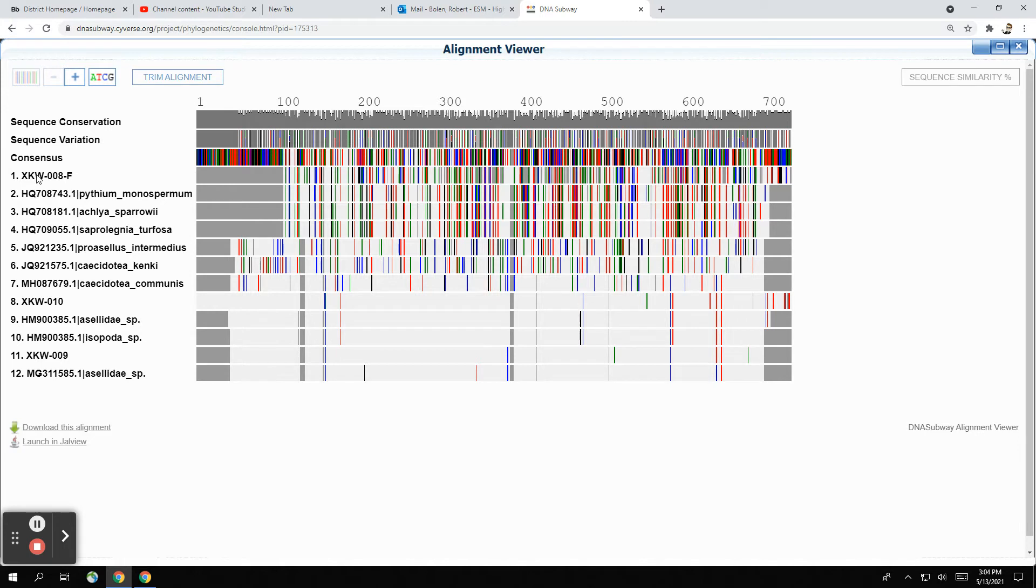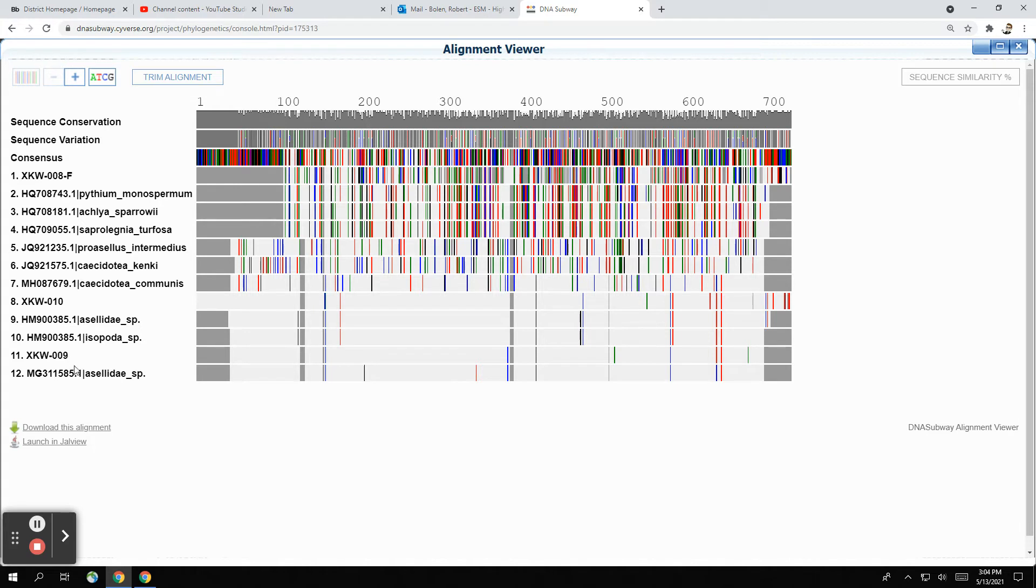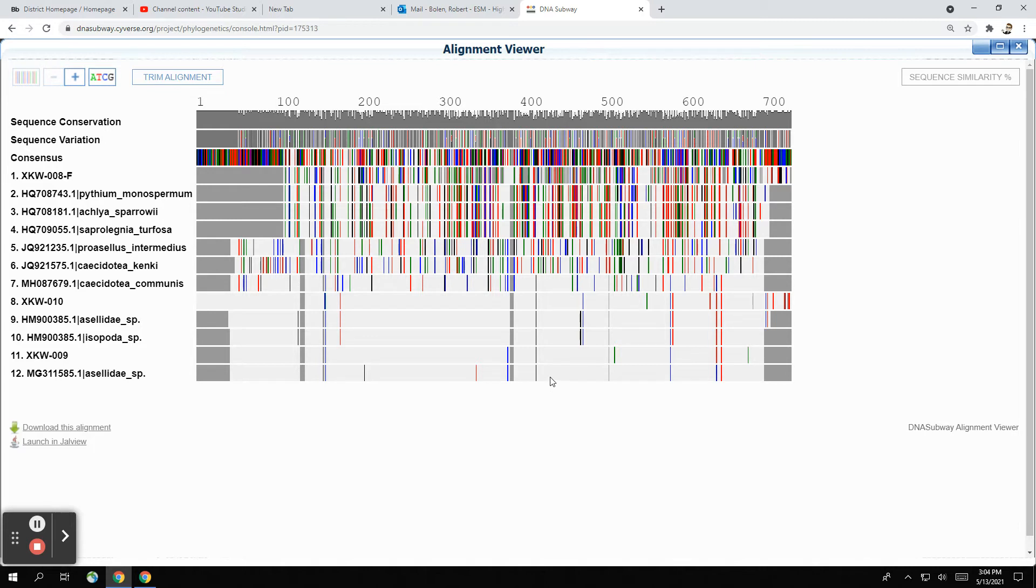And then this is our first sample and this is the top hit for it. Here's the second, third, fourth hit. Here's our other sample and the hits that it matches up with. And then this is the last one and what it matches with. And when you look at the barcodes, you can see that down here, there's really not much variation. There are a couple of little individual nucleotide differences here and here, but for the most part, they look pretty good.